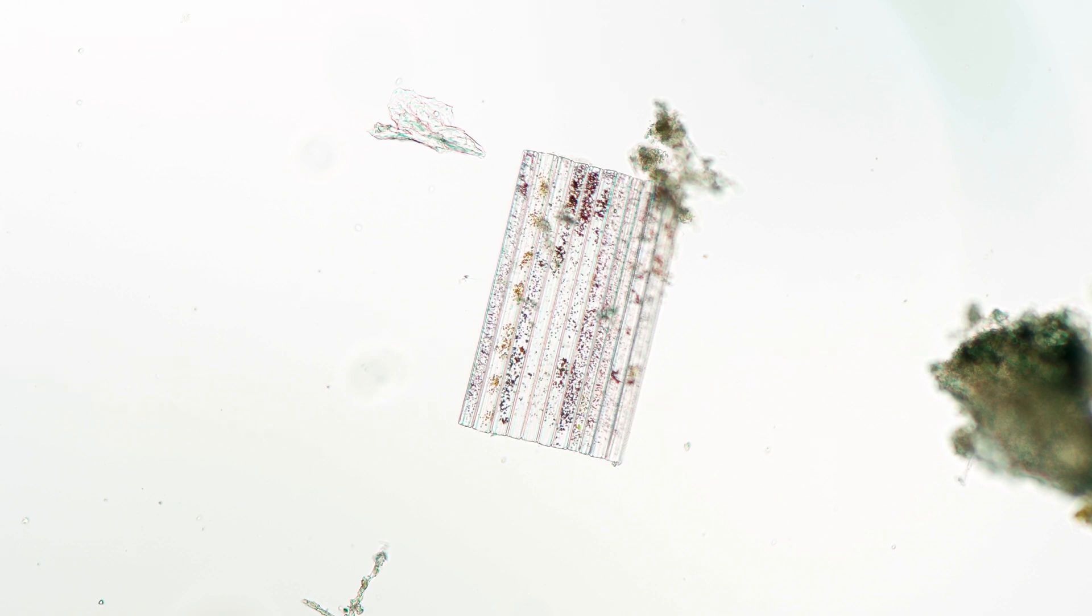Hey, you got a minute to learn about numerical aperture? Good. Check out this dead algae.